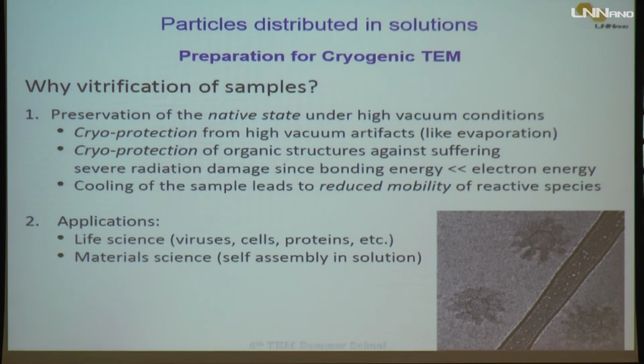Well, and now, if you have particles distributed in solutions, then we can use the cryogenic TEM preparations. Why vitrify the samples? With the vitrification, we can preserve the native state of your material under the ultra-high vacuum conditions that we have inside the microscope, okay?